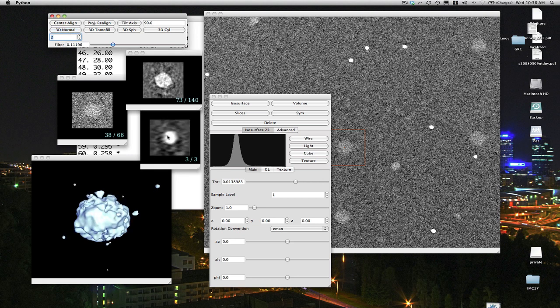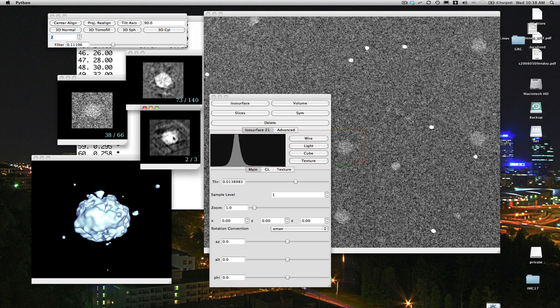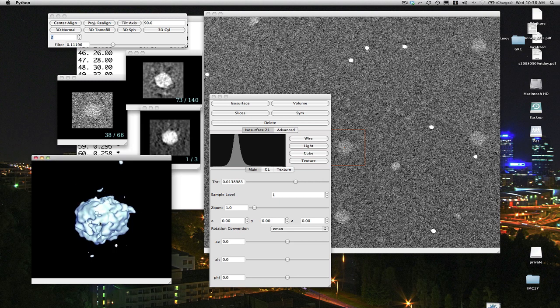There we go. So now you can see the particle's a little bit more localized in this very bad direction, and it looks a little nicer in some of the other directions as well. And here's our reconstruction. So that's pretty much it.